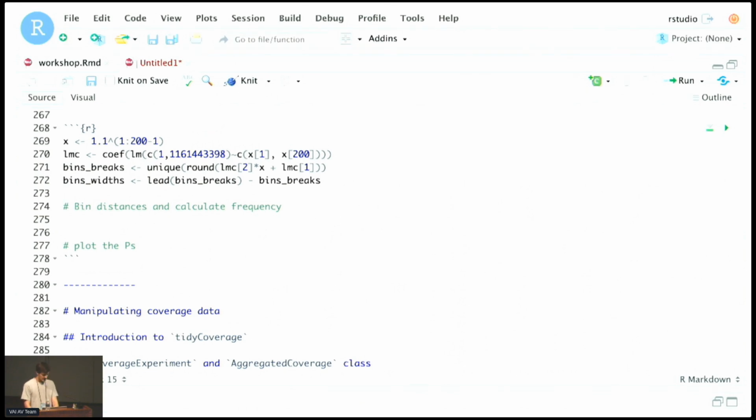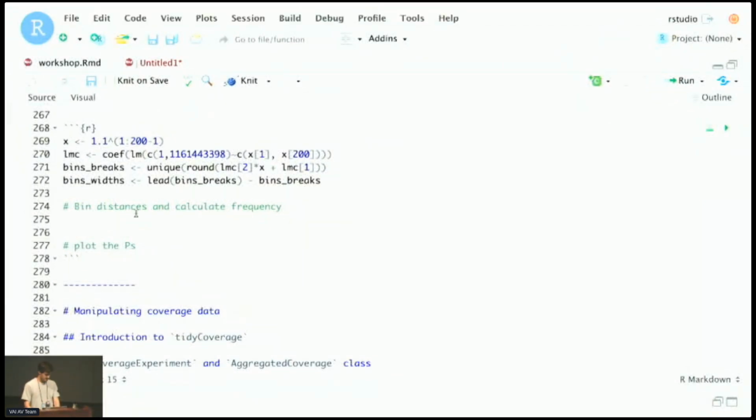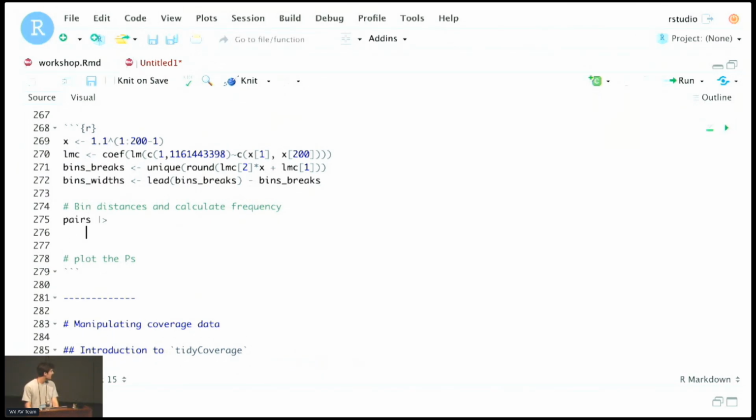Okay, and so one way to use these objects together with our, whoops, let me just go back here. Okay, can that work? Yeah. So now if I take my pairs, again, I add my paradist. We've done that already.